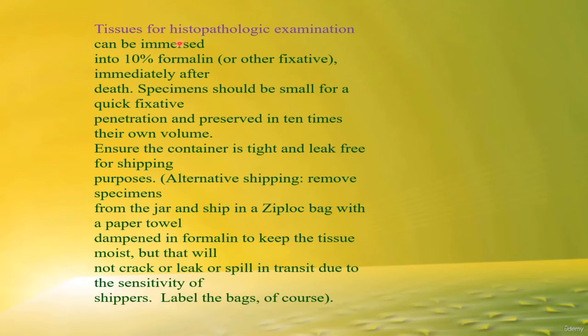Tissue for histopathological examination can be immersed into 10% formalin or other fixative immediately after death. Specimens should be small for quick fixative penetration and preserved in 10 times their own volume. Ensure the container is tight and leak-free for shipping.